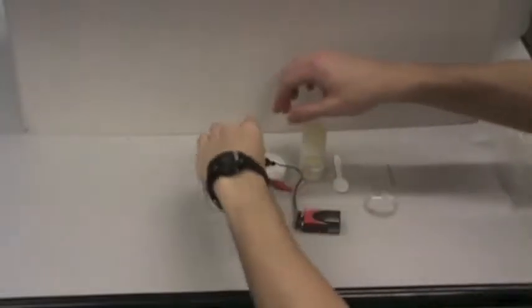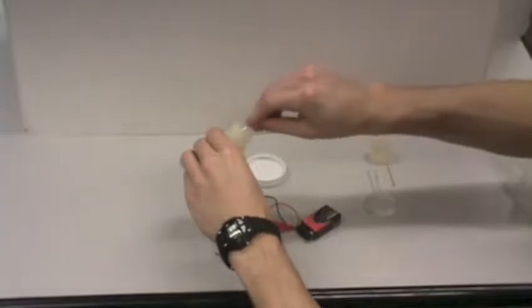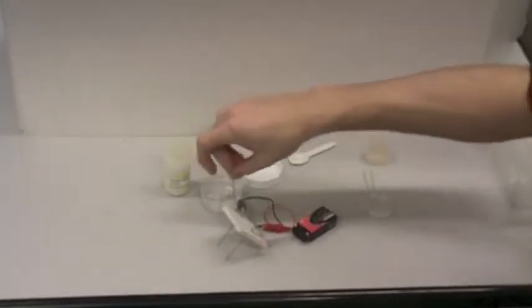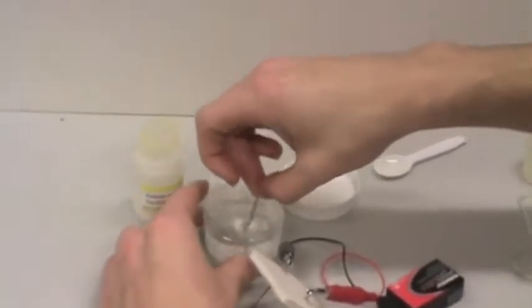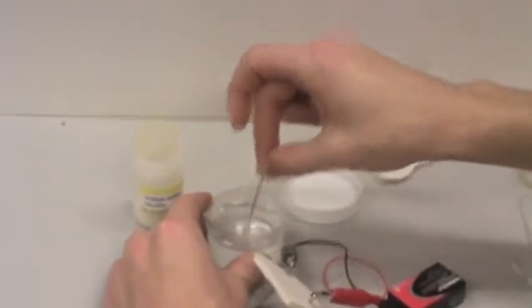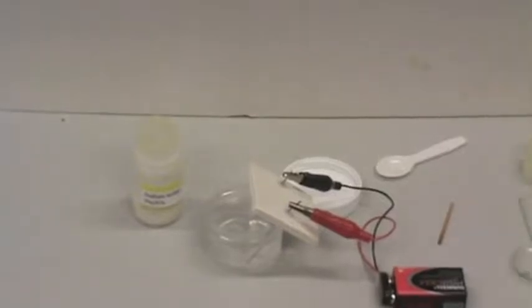Tell students to use the small plastic scoop to add the sodium sulfate to the jar of distilled water. Stir the water and the sodium sulfate with the toothpick. Place the electrodes into the jar. Record observations on the observation sheet.